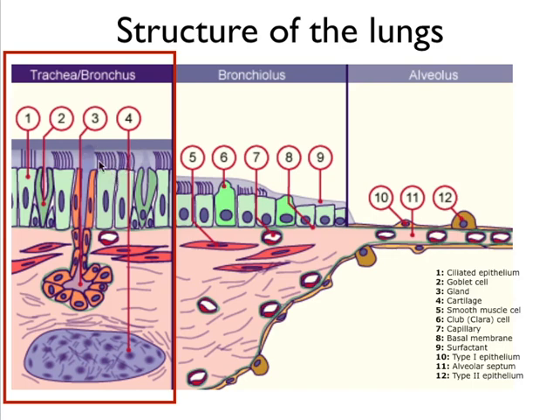So this mucus is produced by two structures. First, the goblet cells here, named because they look like a goblet, like an ancient wine glass, and there are mucus producing glands shown here. Furthermore, here you see the smooth muscle bundles, and of course there are little vessels for blood supply.